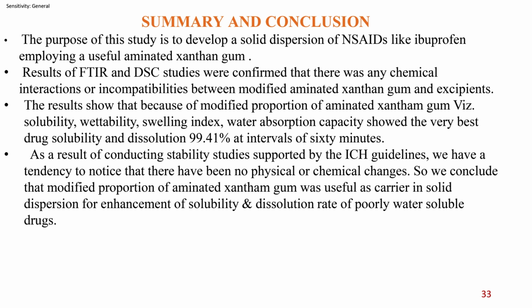Moving at last with the summary and conclusion. Our main purpose was to employ aminated xanthan gum, and the results of FTIR and DSC studies confirmed that there were no chemical interactions or incompatibilities between modified aminated xanthan gum and its excipients.